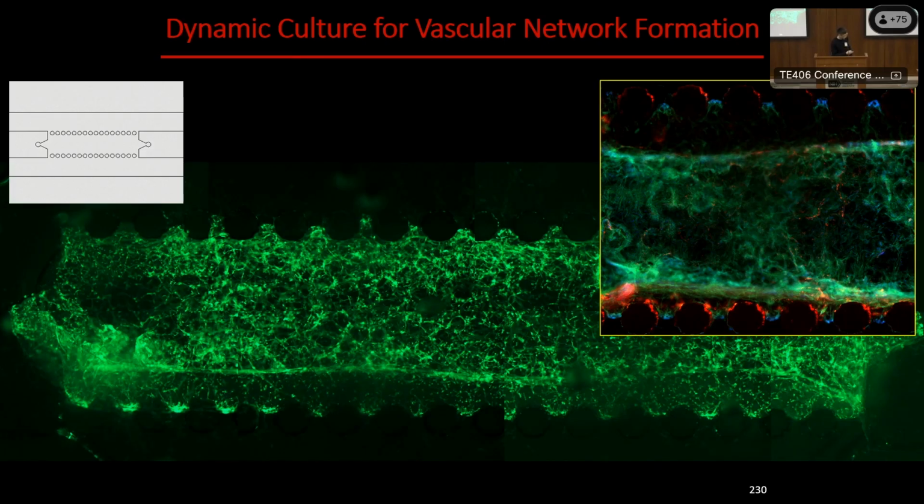We can perfuse microparticles from one side, and you can see some of the particles going through the entire structure of the vascularization. That's the first step, and we're now trying to integrate that with the organoid cells and also the epithelial cells in the sac-like structure, as I mentioned in the beginning. So I'm going to stop there. Thank you again for this opportunity, and I'm very excited to be looking forward to our potential flights in the next couple of years. Thank you very much.